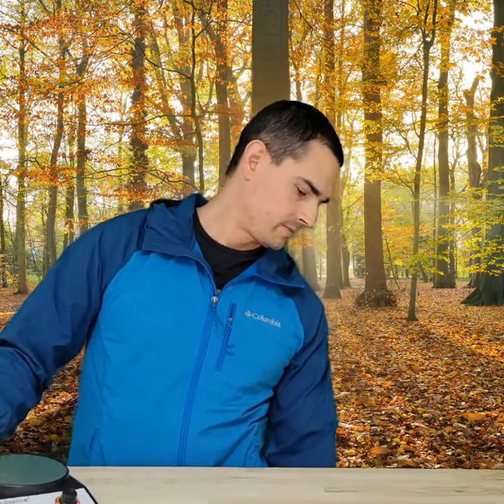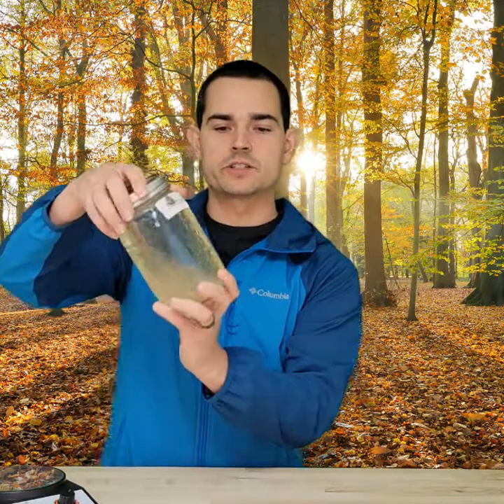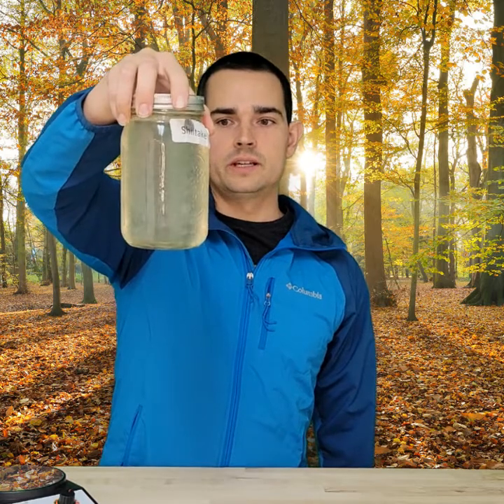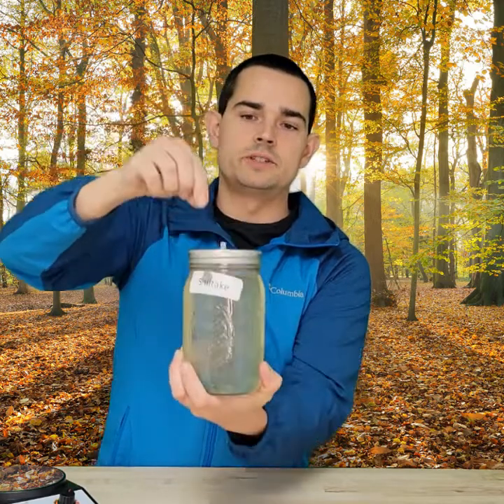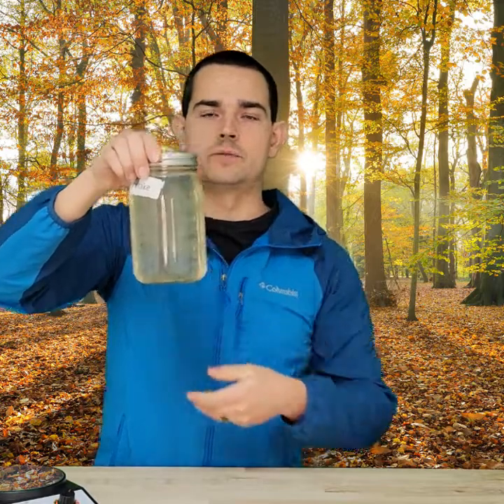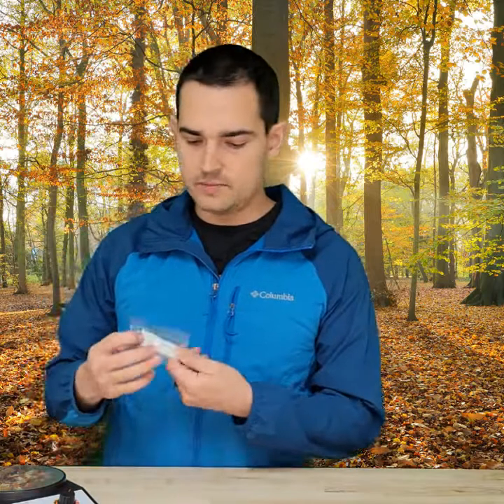Once you have your liquid culture done, I have a marble in here that I can swirl around. As you can see, it breaks up the mycelium and keeps it in a size in which you can suck it up into a syringe to inoculate whatever grain bag you'd like to inoculate with.